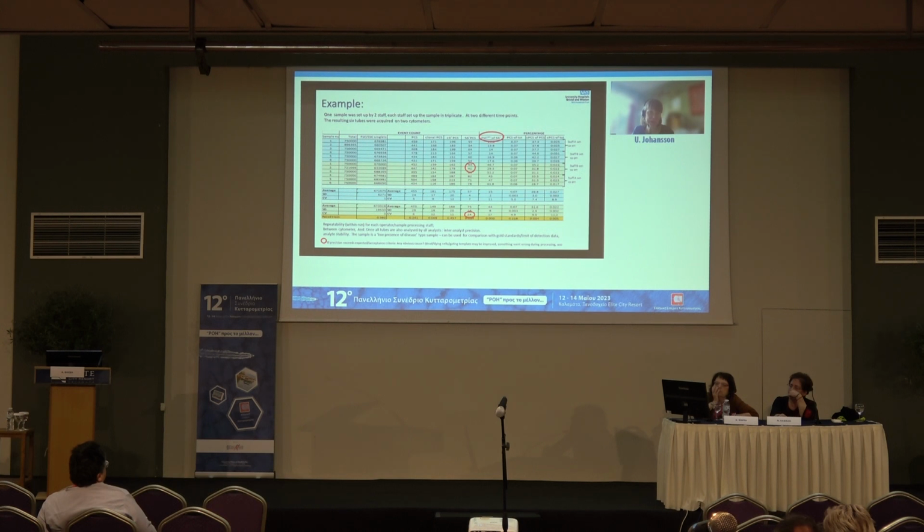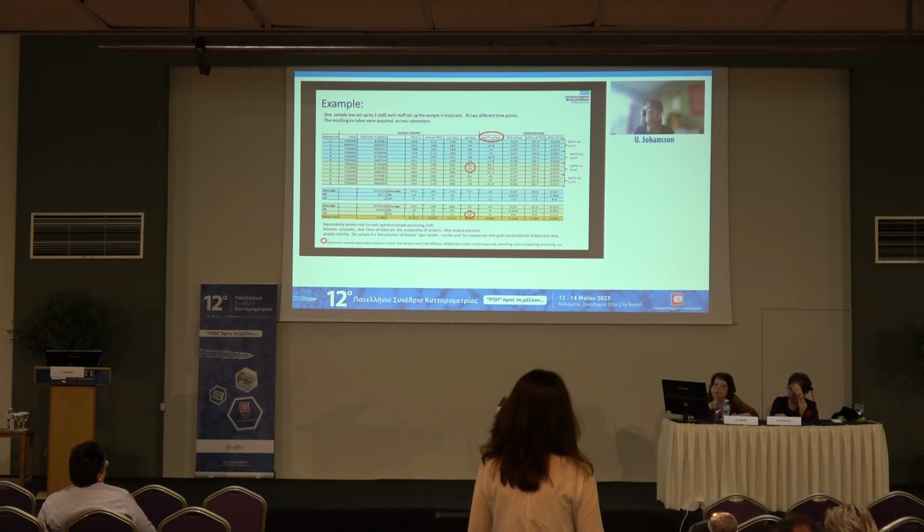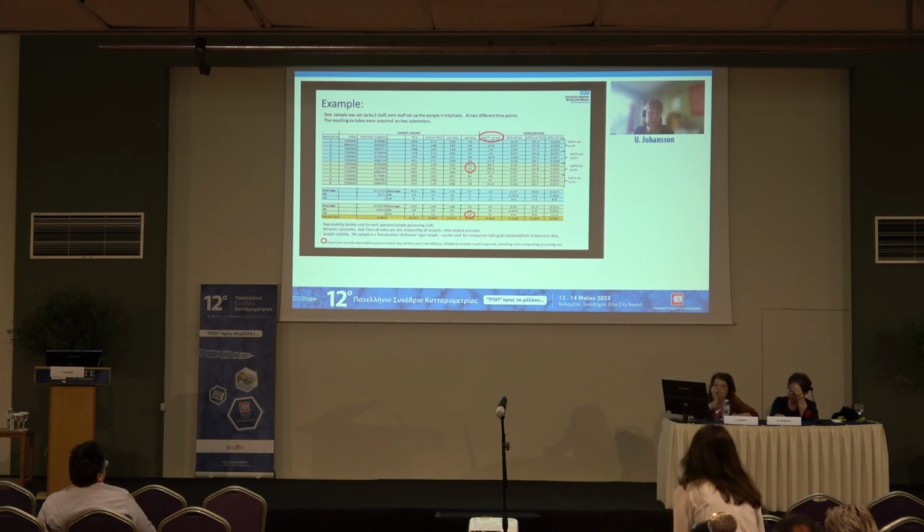And then for each and every one of these, this is just one analyst's entry. This was for the plasma cell, so we take the total number of events acquired, singlet number of events acquired, total plasma cells, clonal plasma cell event count, and then we looked at the individual phenotype, how many CD19 positive plasma cells, and so on. And here I seem to have honed in on a particular population, which I assume was a neoplastic population. I can't actually remember now, this was a few years ago.